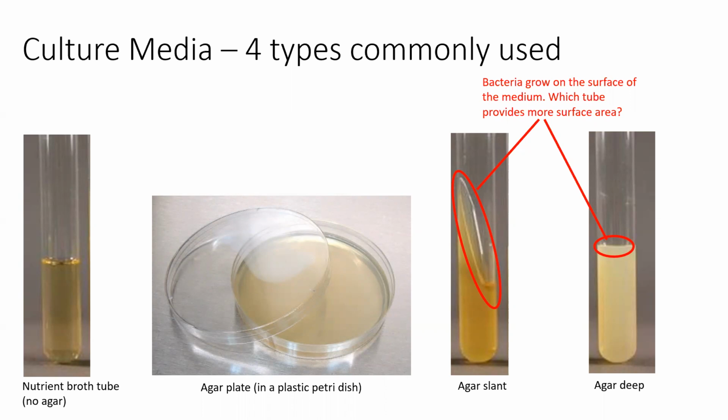Similarly, with motility, we can stab that agar and organisms that have flagella are able to swim away from that stab line where you introduced the bacteria. But organisms that aren't motile are stuck in that stab line where you put them because they can't swim away. So there's a couple of uses for the deeps, but we won't use that media all that often.